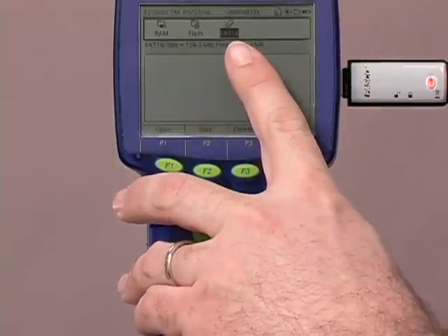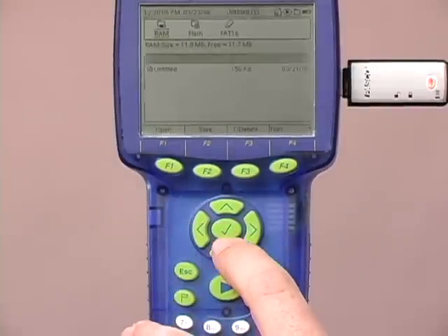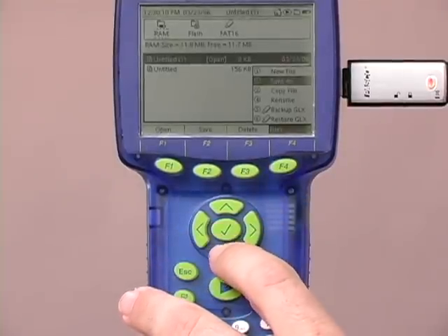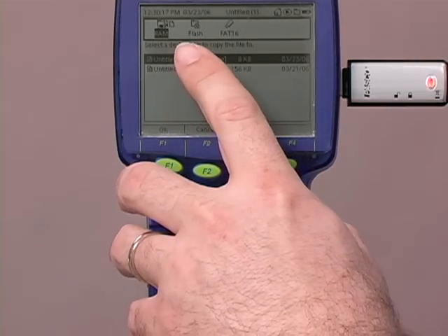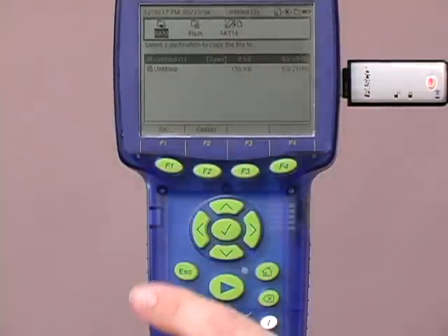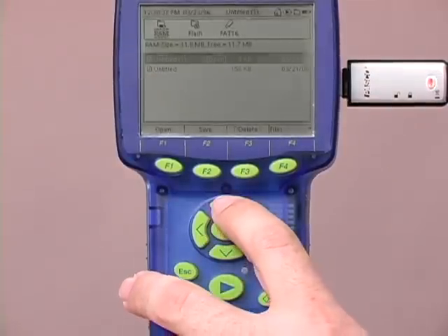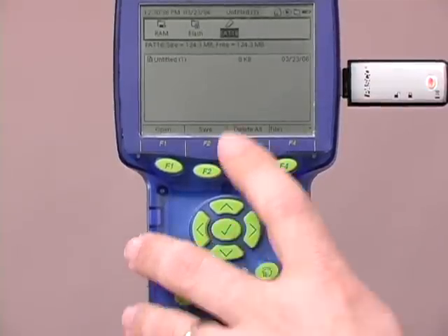The flash drive automatically opens up as another storage option. I'm going to move back to my regular memory, select the file that I'm interested in — the one that I've been working on. I'm going to select the file menu here, move down to copy, and select it. As you can see, the icon changes slightly, and I'm going to move that down to the destination, which is my flash drive. I simply press the check button and the file has been transferred. Let's verify that by checking out the flash drive — and there it is.